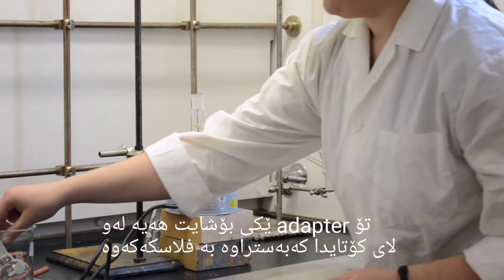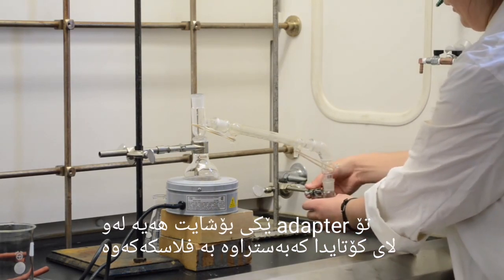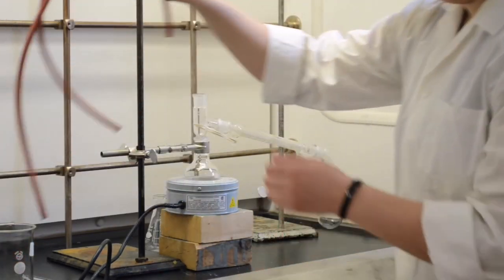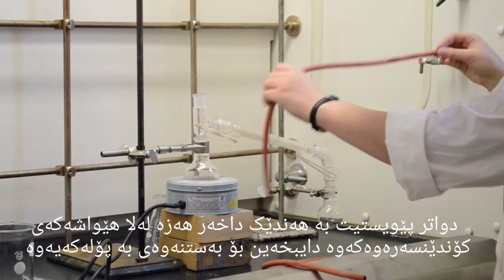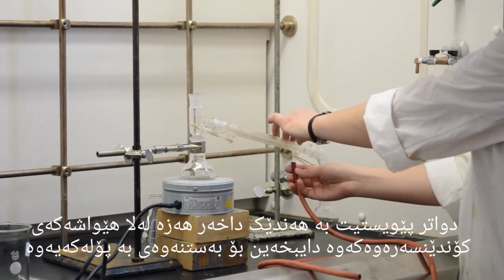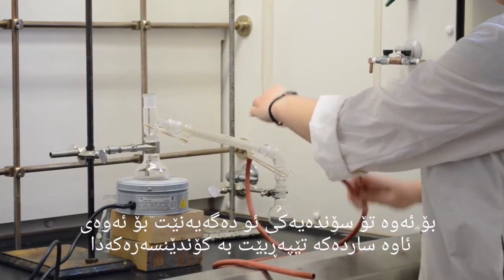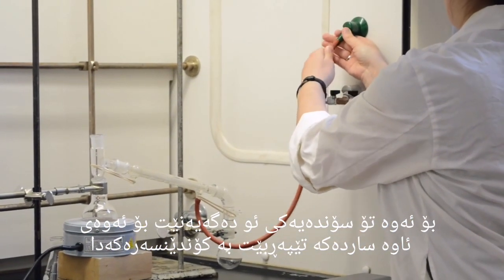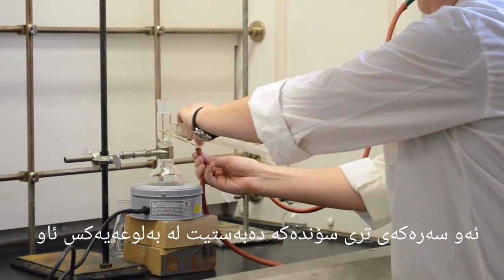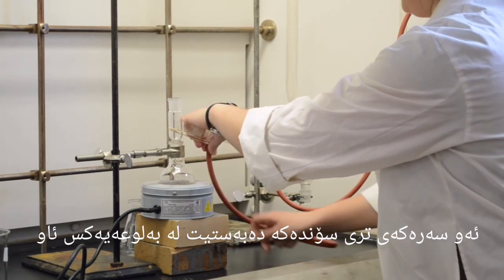Once you've got your vacuum adapter on the other end, a receiving flask can be added and clamped. Next, you need to add some hoses. From the lower side of the condenser, closest to the receiving flask, that is where you attach the hose to the cold water. The more elevated side is where you attach a hose leading to a drain.